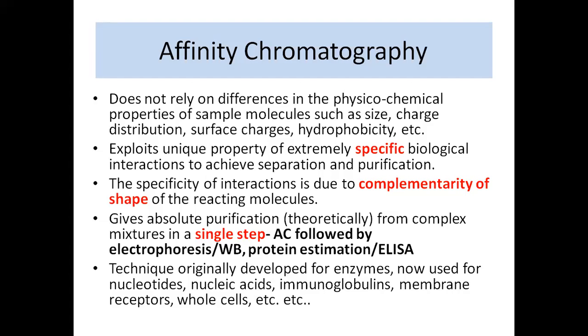And therefore, this particular method is a kind of absolute purification method. Absolute purification method means what? In one single step, your molecule of interest will bind to the column. All the other molecules will move away and go out of the column. Only your desired molecule will stick to the column. Is that clear? Yes or no?